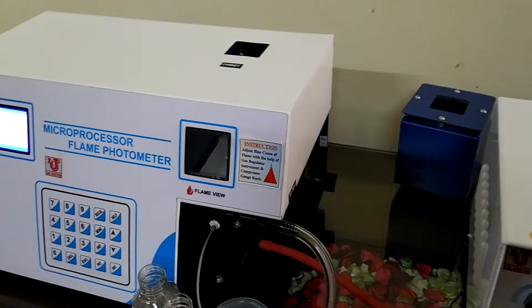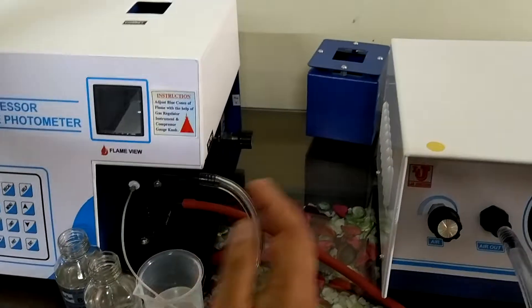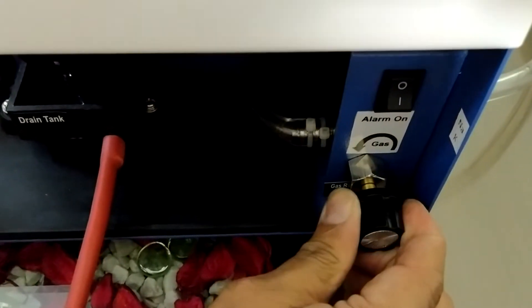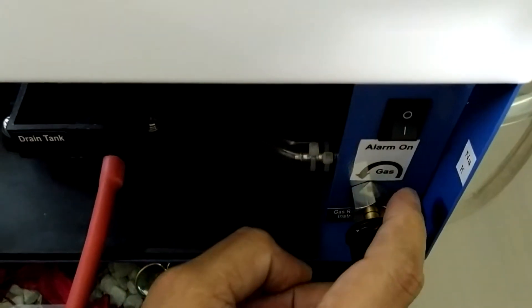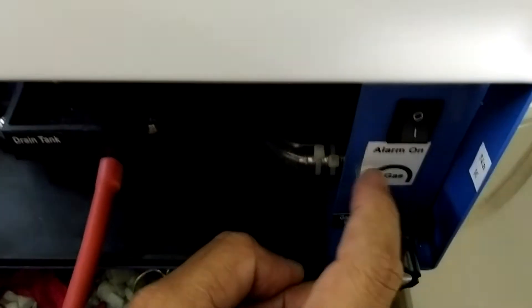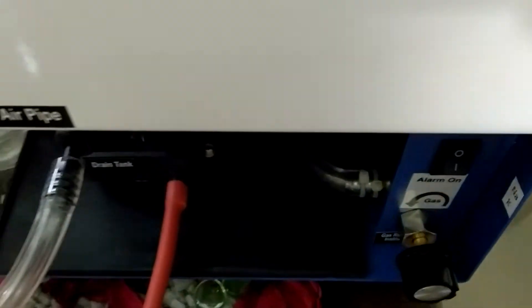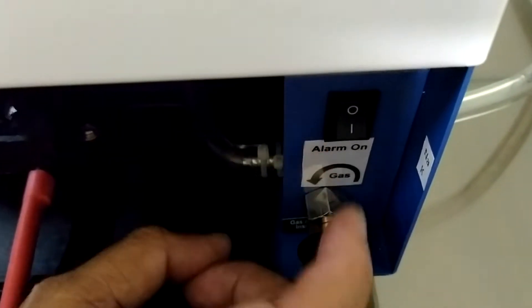Now, how to light the flame of the flame photometer. This is the gas regulator. First, minimize it — turn it to the minimum mark. This is the minimum mark, and this is the maximum mark. You have to set it to minimum. This is the alarm indication for gas.